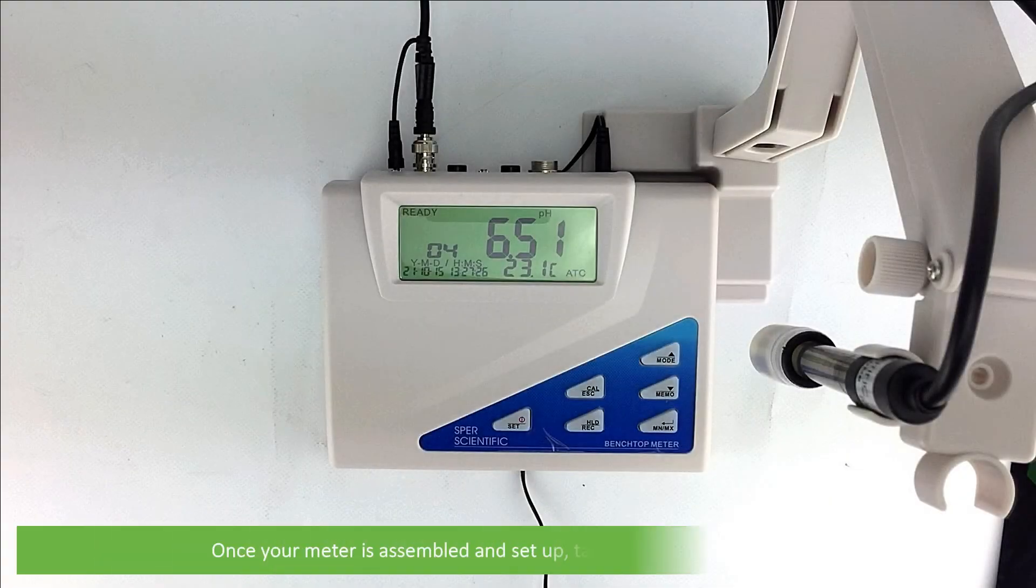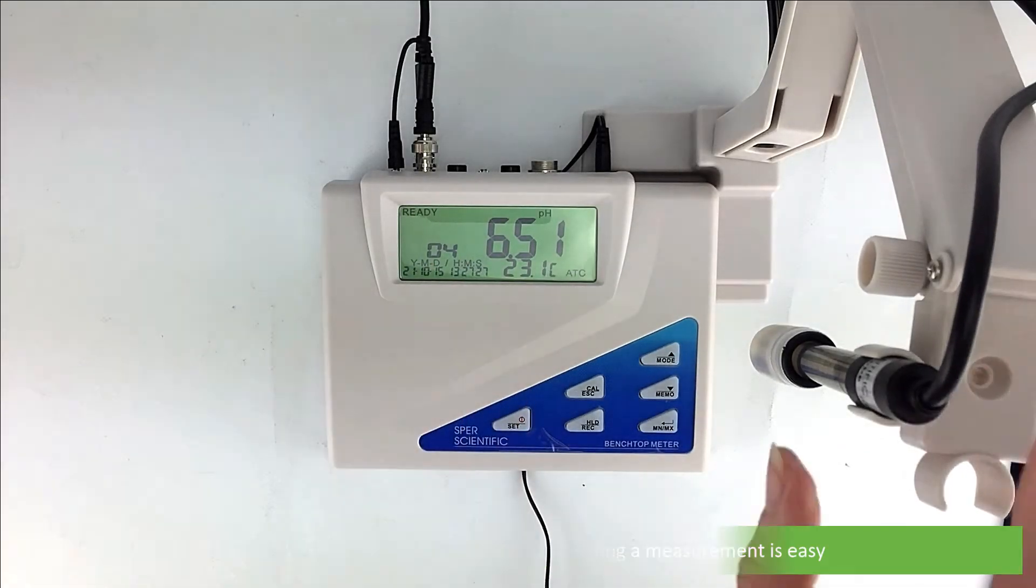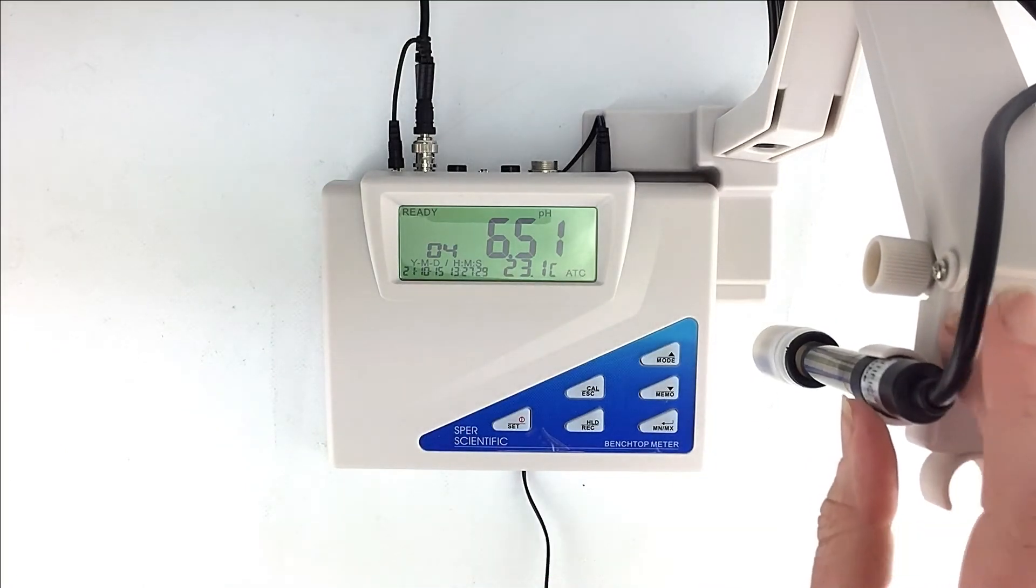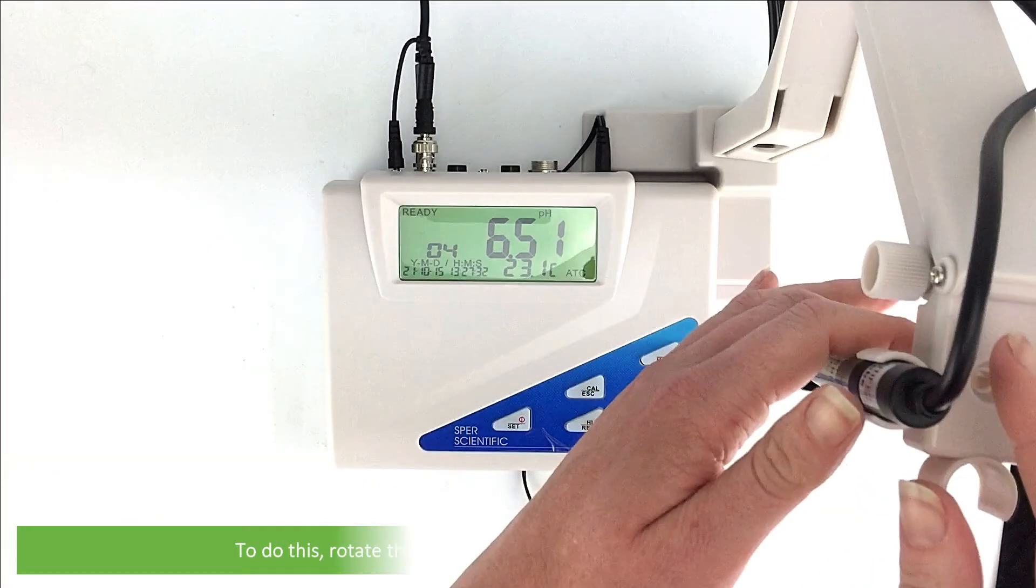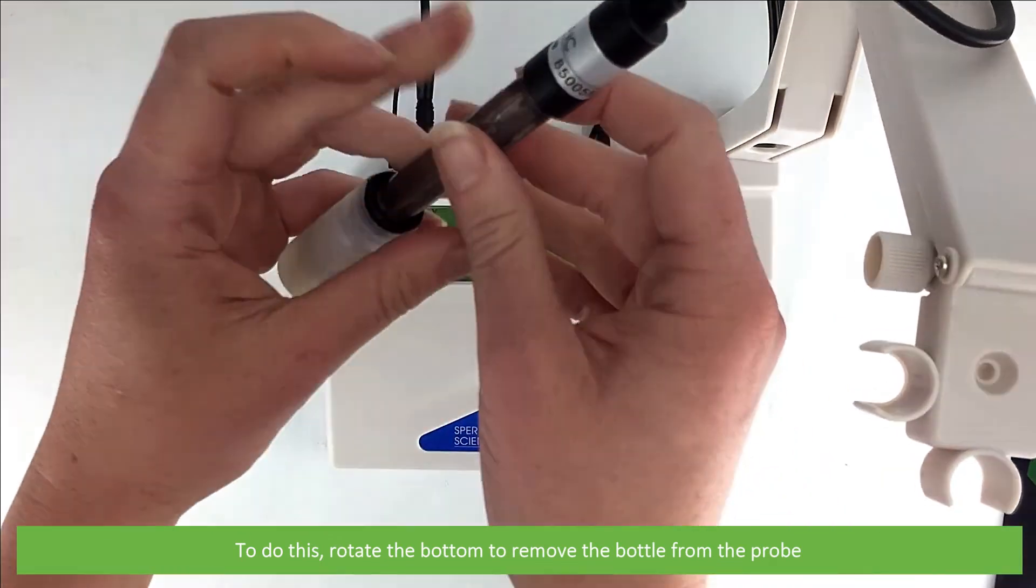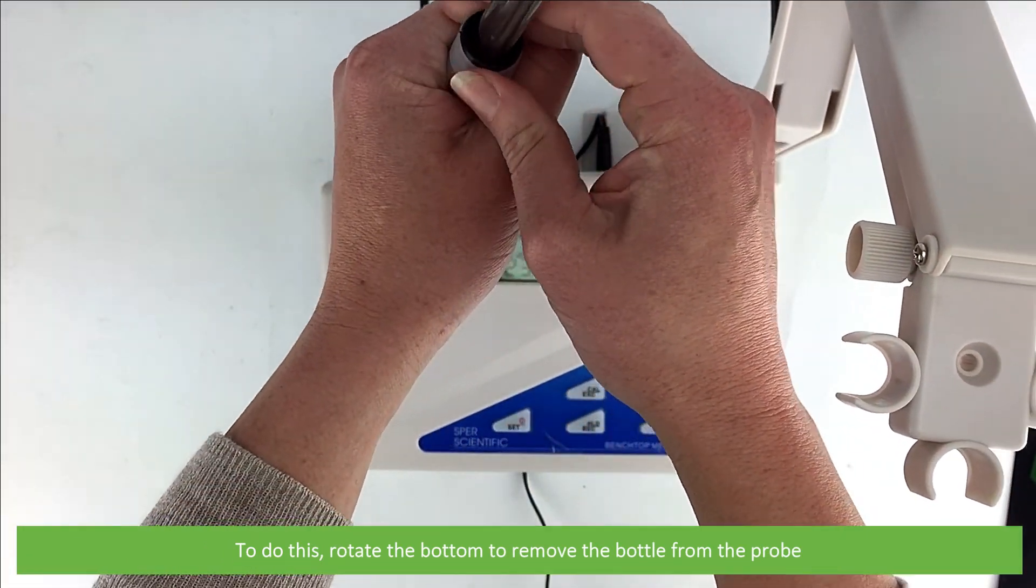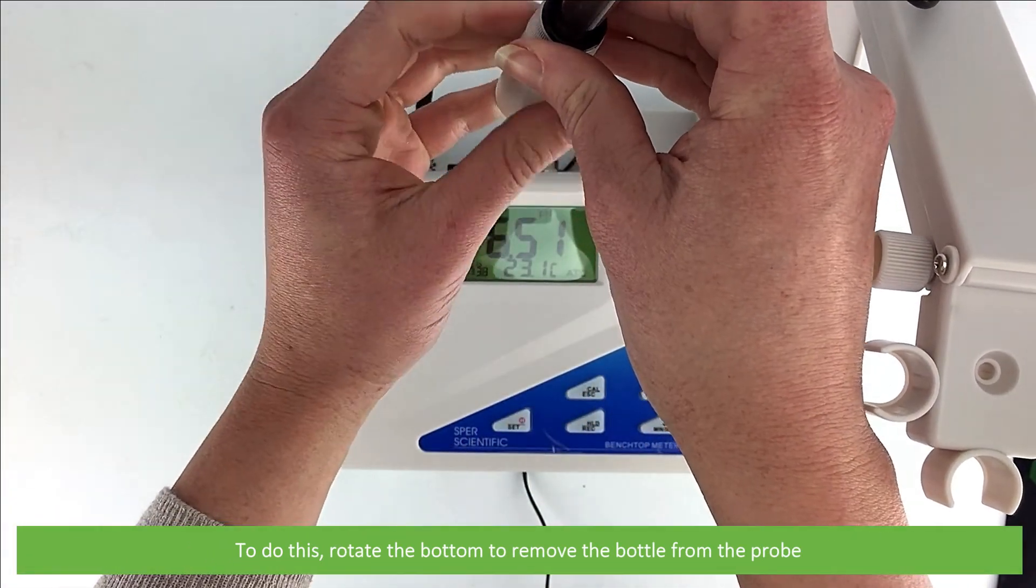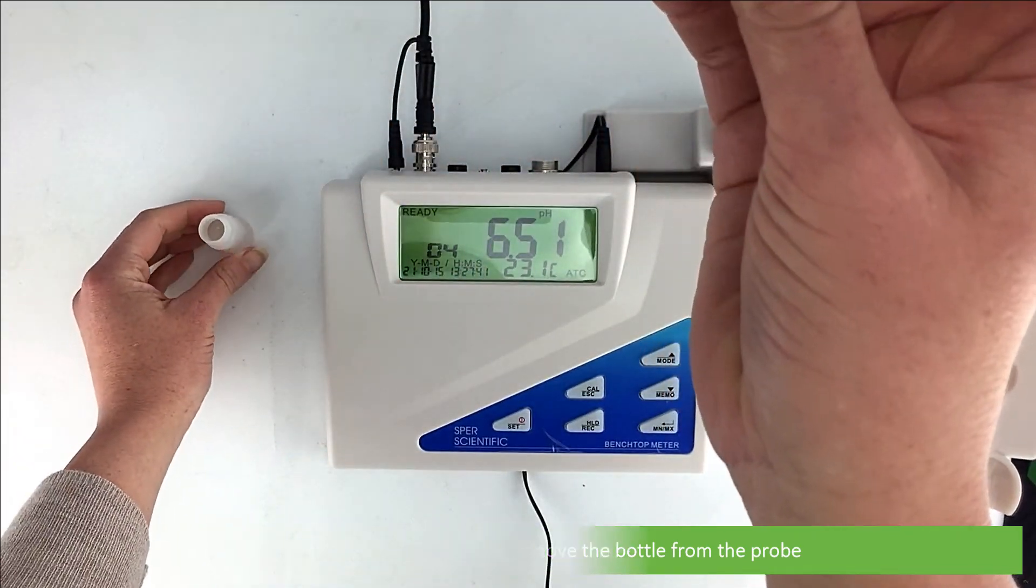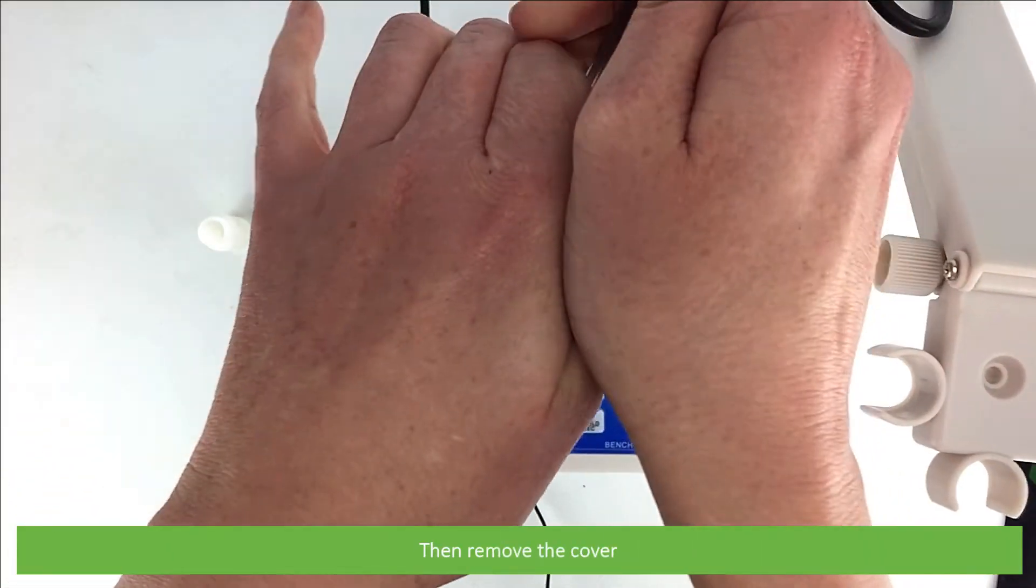Once your meter is assembled and set up, taking your measurement is easy. Remove the storage cap from the electrode. To do this, rotate the bottom of the storage cap to remove the bottle from the probe. Then remove the cover.